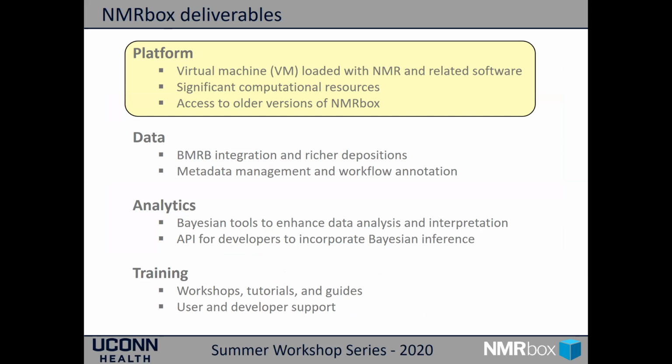And the NMRbox project itself has what I'm breaking down to 4 main deliverables. One of them is the platform, which is the virtual machine that has all the NMR software related and all the back-end infrastructure needed to make that happen. There is another component to NMRbox that I'm listing as data, where the idea is to do better metadata management and workflow annotation, and better integration with the BMRB for richer depositions.